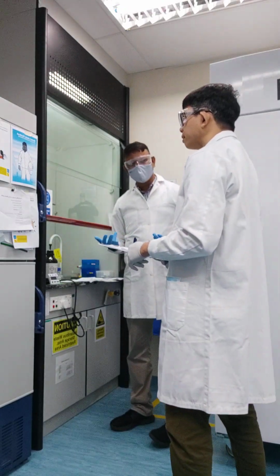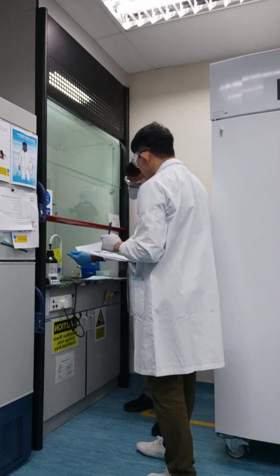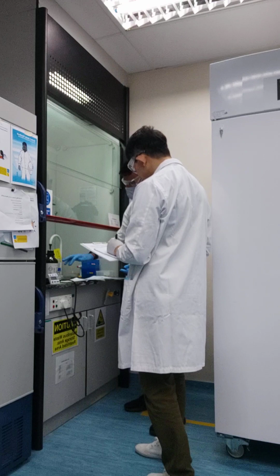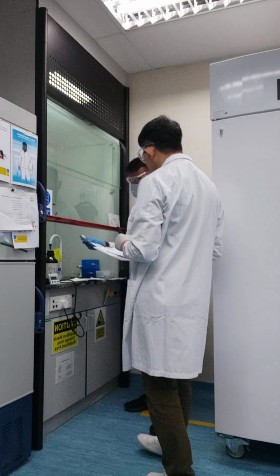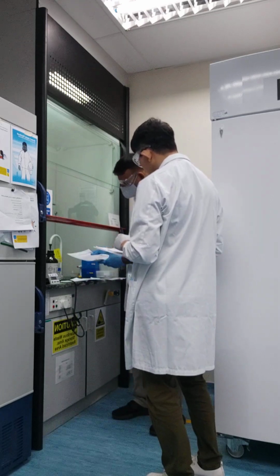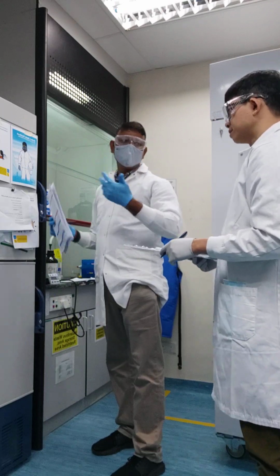You have any questions? Can we repeat one more time? The first step is to ensure, based on the test method, right, the batch sheet, you check the material against the batch sheet. Ensure you take the correct material. Right. The second step is to make sure that you understand all the hazards of the material by having the relevant safety data sheets. Right. Okay? And thirdly, you need to ensure you recognize the hazard symbols. Okay. And you can refer to the global hazard symbols chart for understanding.